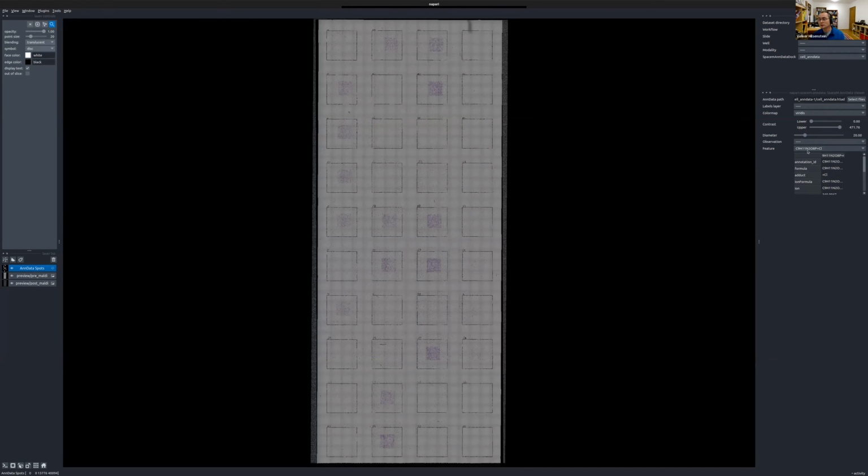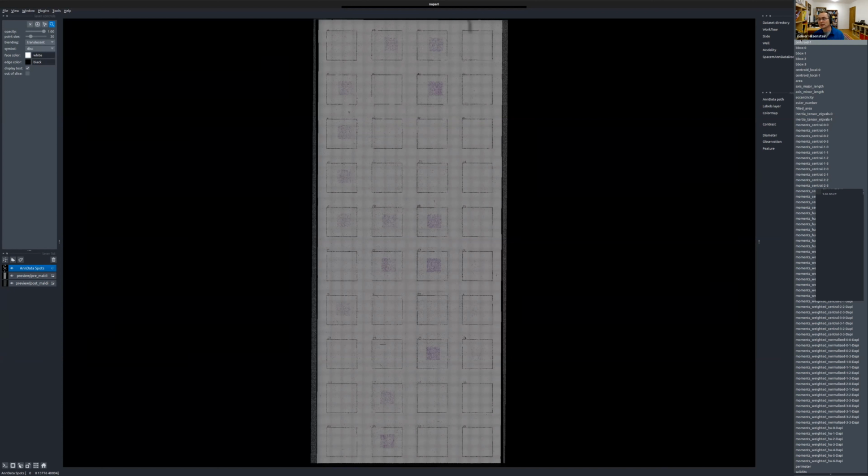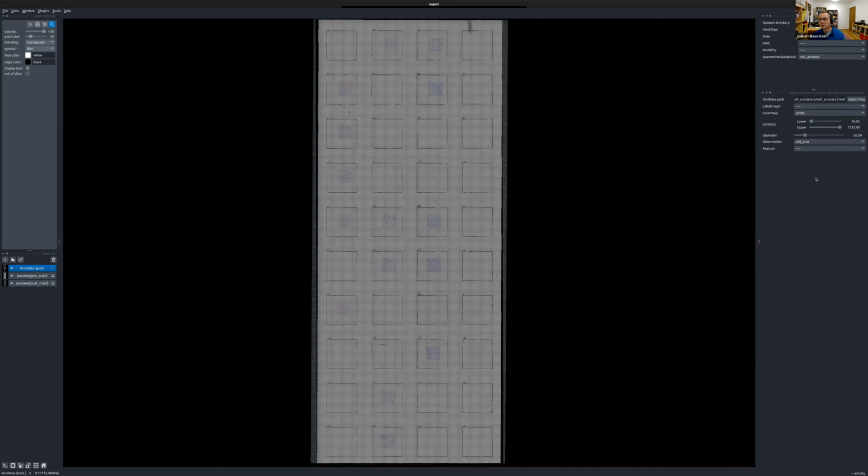But now you can use this observation, for example, this feature here, the molecule, or I'll switch to the cell area again, because I noticed we have a gradient of cell area across the slide. So if I amp that up a bit, you can actually see that the cells here in these wells are substantially larger than the cells here on the left. If I were to zoom in, you can actually verify that that is true, but you see it nicely with the heat map. So you have this whole overview of your experiment. I'll conclude the live demo with that.